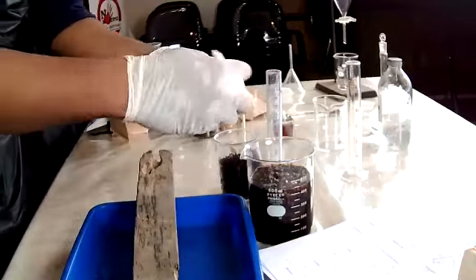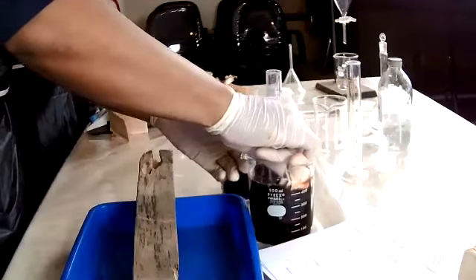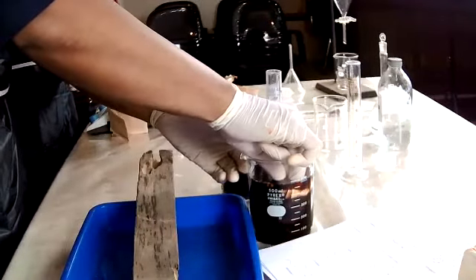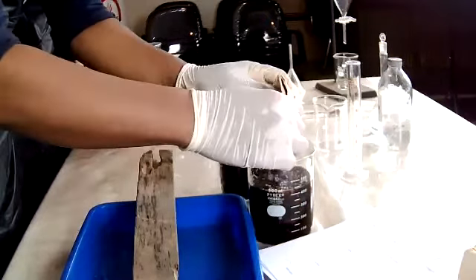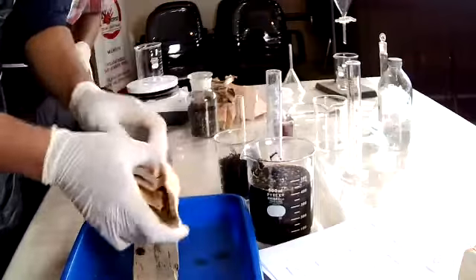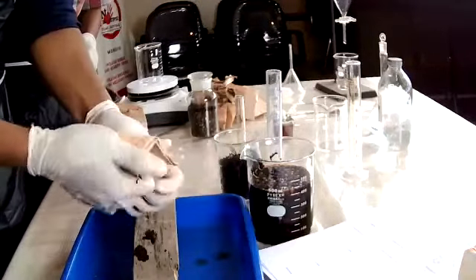We're going to apply the solution using this dried banana stalk. And just crumble the banana stalk so it's easy and it's more absorbable for the solution here.